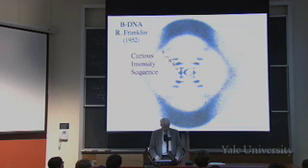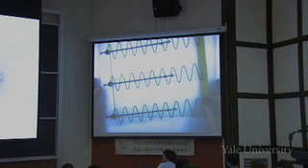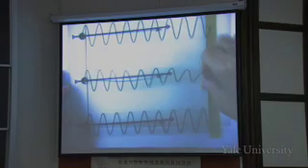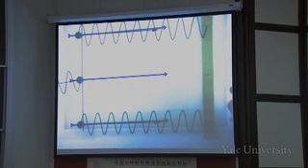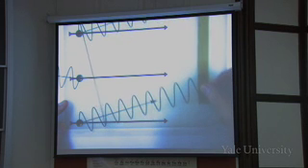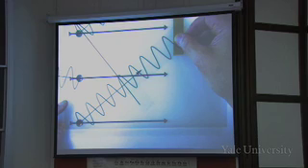Remember, if we looked at the first, second, third, and so on, we saw that they come in and out of phase. But suppose you have things that are twice as close together as in the first case. What effect does that have on the actual pattern we see? The pattern we saw if we had only every other one was here: the direct beam, first reflection, second reflection, third reflection, fourth reflection.